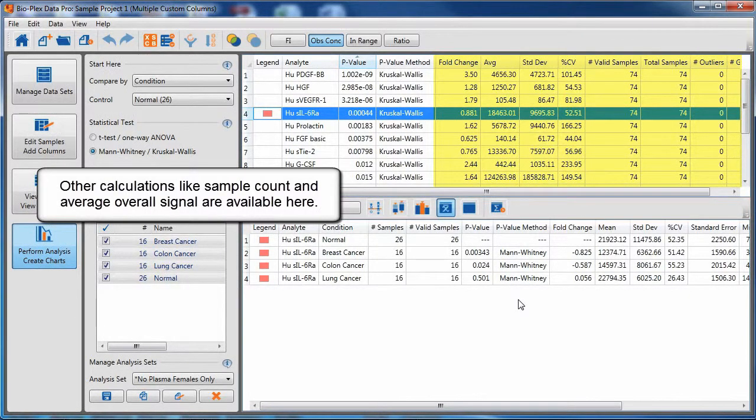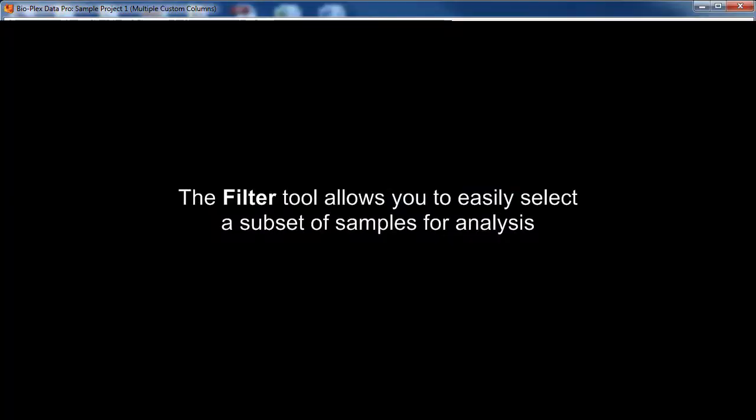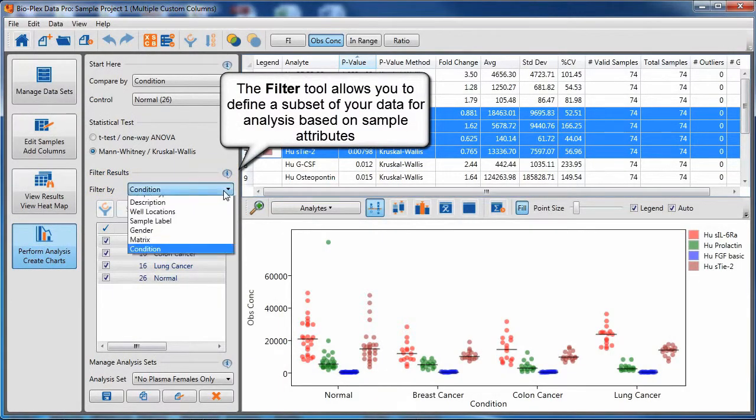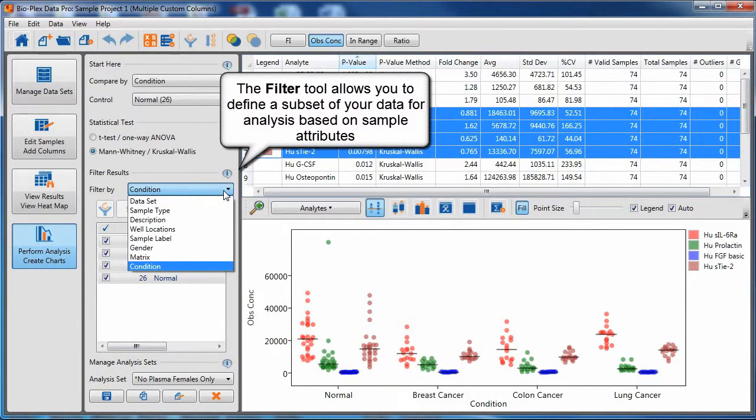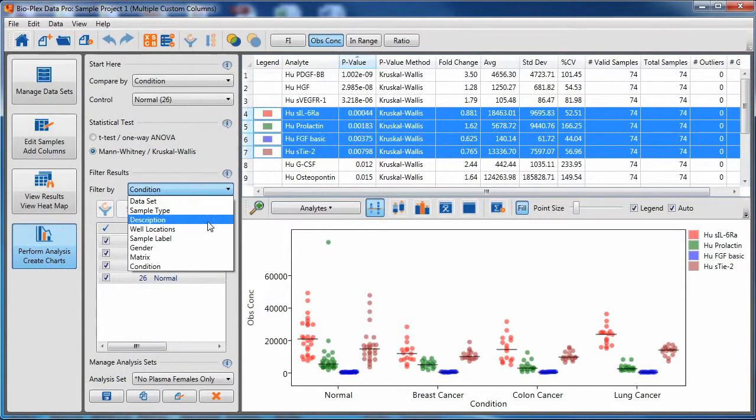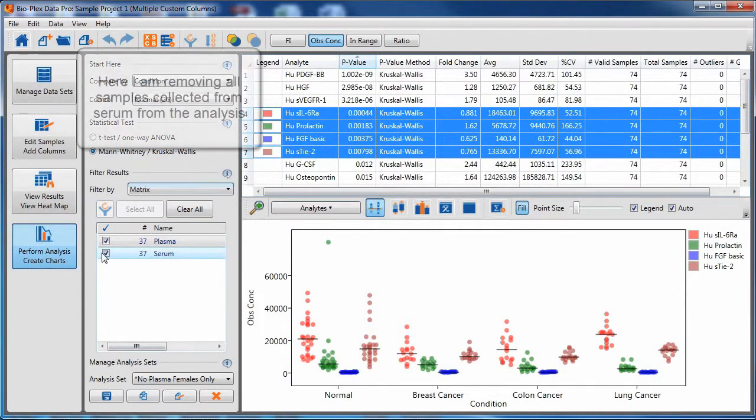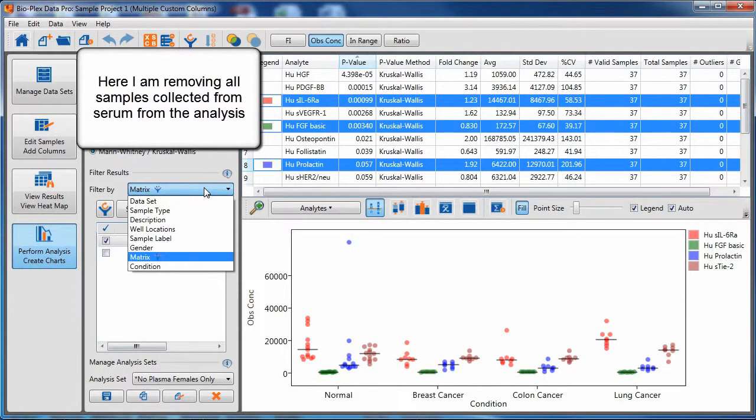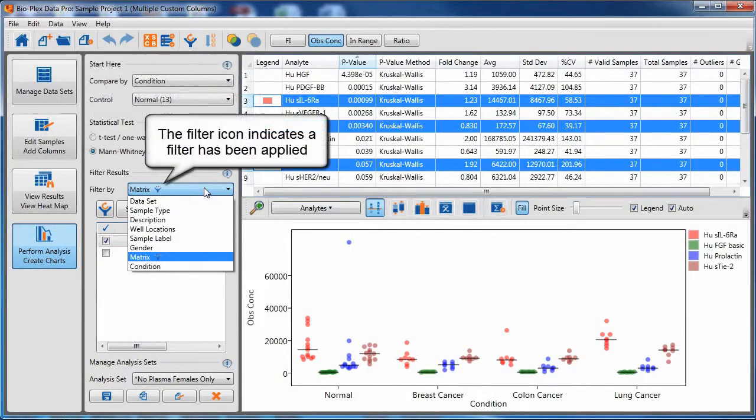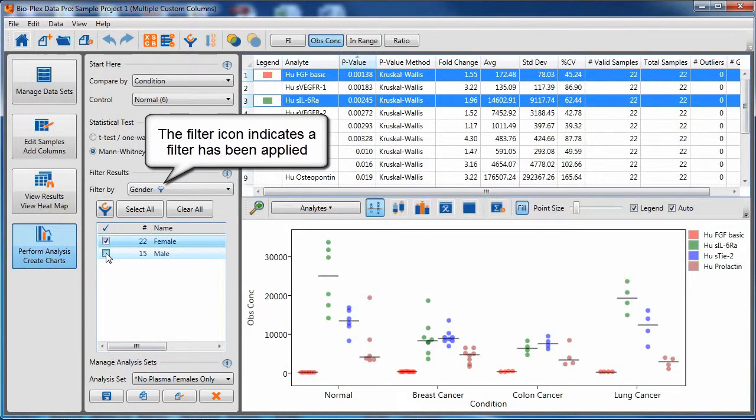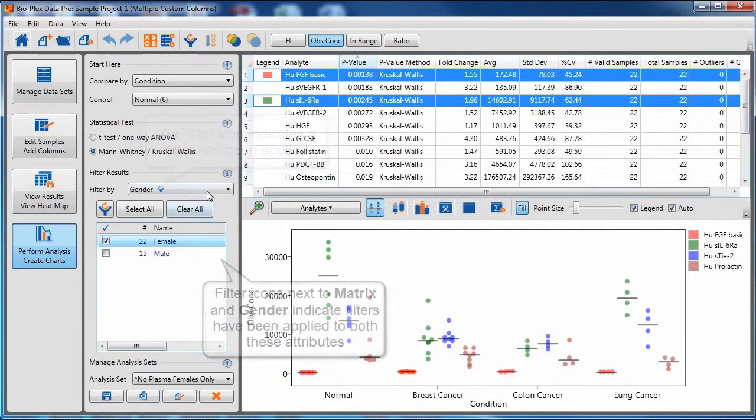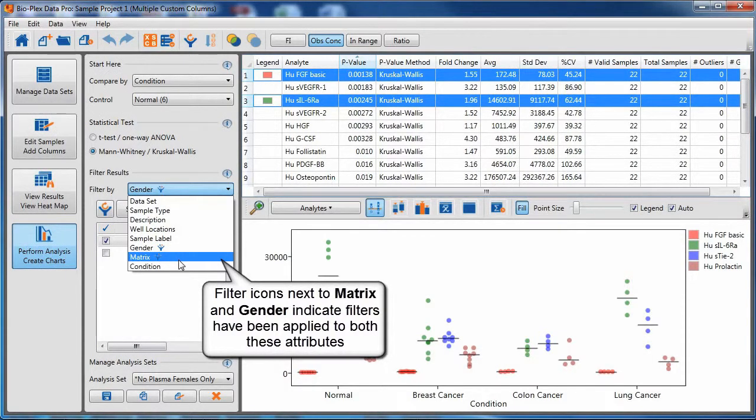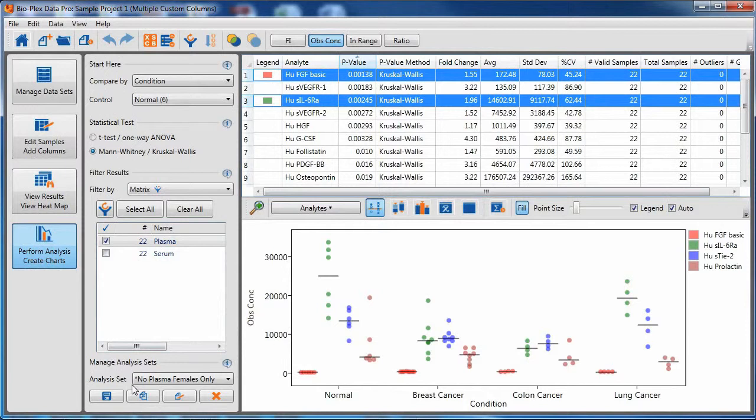Other calculations like sample count and average overall signal are available on the right. The filter tool allows you to easily select a subset of samples for analysis. Use this pull-down menu to identify the attributes or the column from your sample list that you want to use for filtering your results. Here, I am excluding serum from my analysis. I have chosen gender and excluded male. Note how the filter icon indicates which column or attribute a filter is applied to.